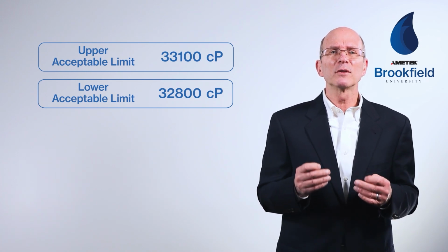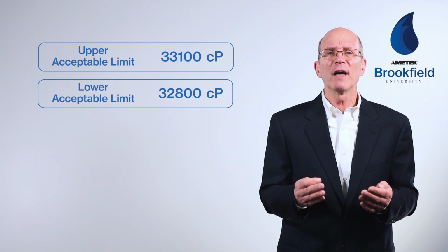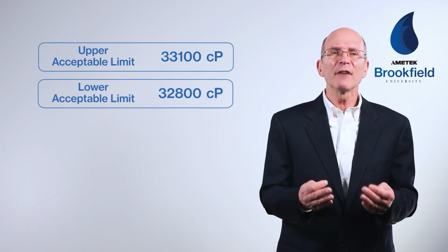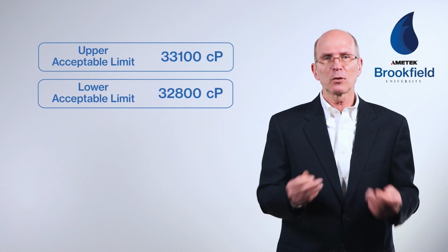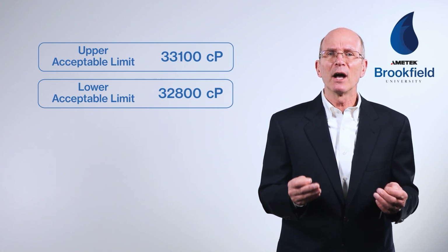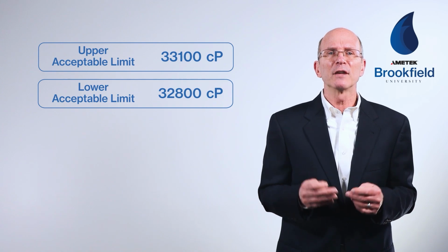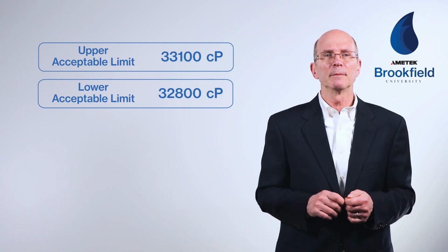As long as there is any overlap in the viscosity values when taking into account the instrument's accuracy, we have to state that, based on the accuracy of the instrument, these two values are considered the same. This indicates the fluid has fully recovered its viscosity.